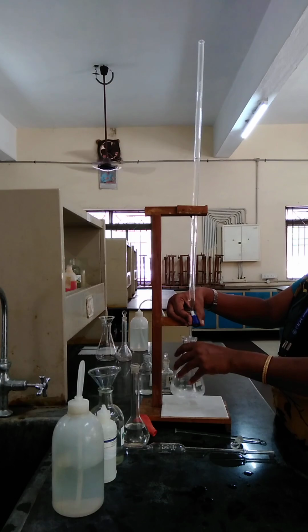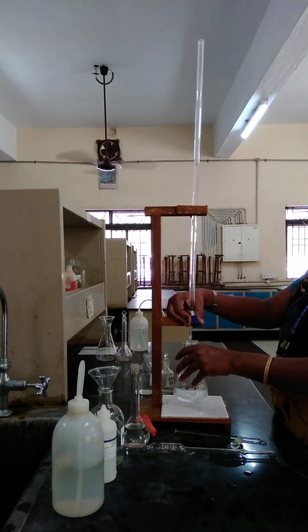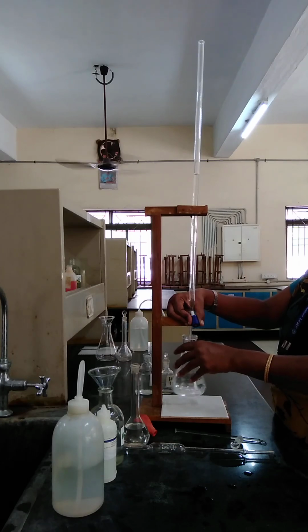Now for the HCl we made up, we don't know how much concentration it has, so we'll see straight away. It is supposed to be a permanent pale pink color. So slowly swirl clockwise to get the endpoint carefully. You don't know the range of the endpoint now, so you have to do it carefully.